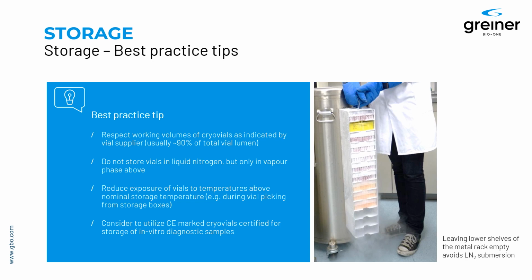Also, you should reduce the exposure of vials to temperatures above nominal storage temperature. I mentioned this already earlier. Make sure that your picking times are very quick, that before you pick a sample, you make up your mind about its location so that you find it very quickly.